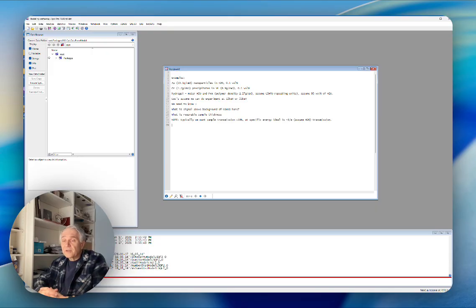I would hope that other instruments provide similar tools for their users, but the primary use of this is for the USAXS users, mainly the future ones who have not yet measured the samples and want to know if the samples will be suitable and how thick to make them.